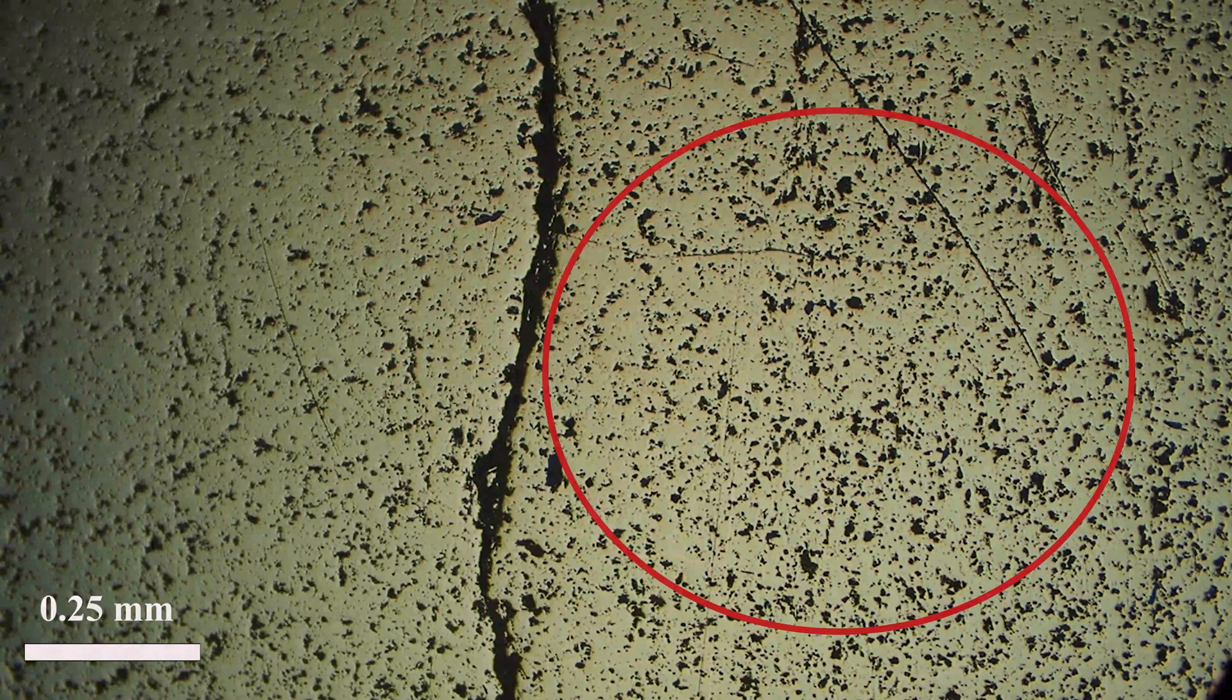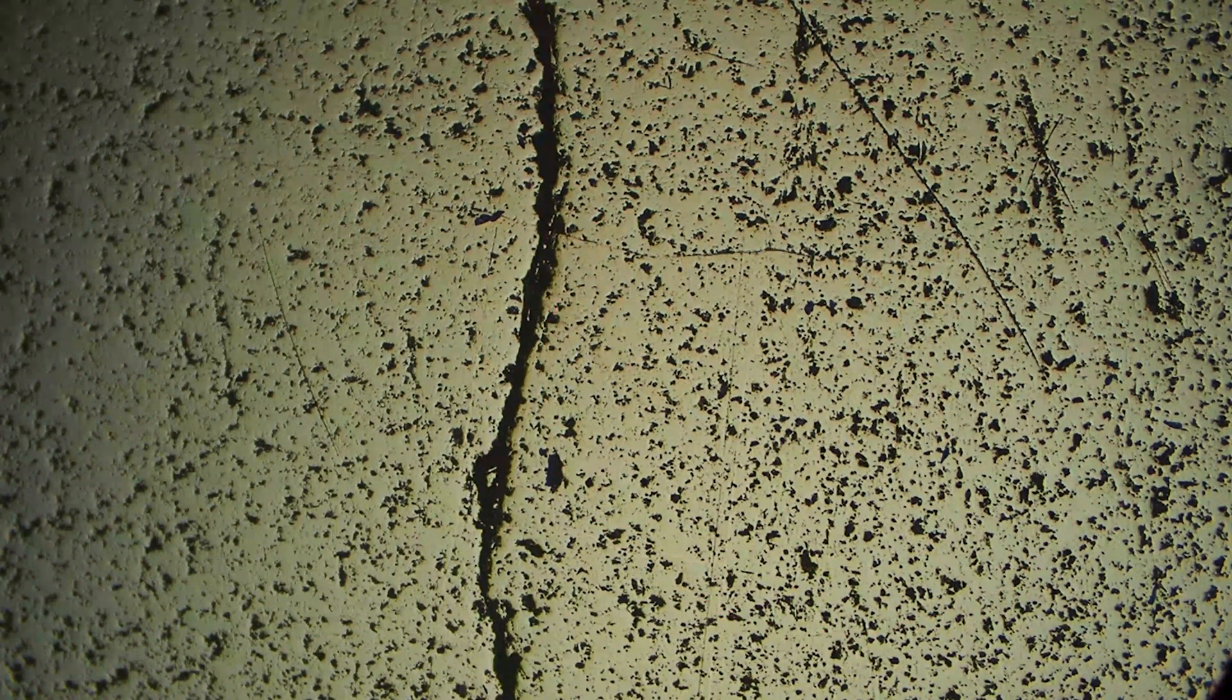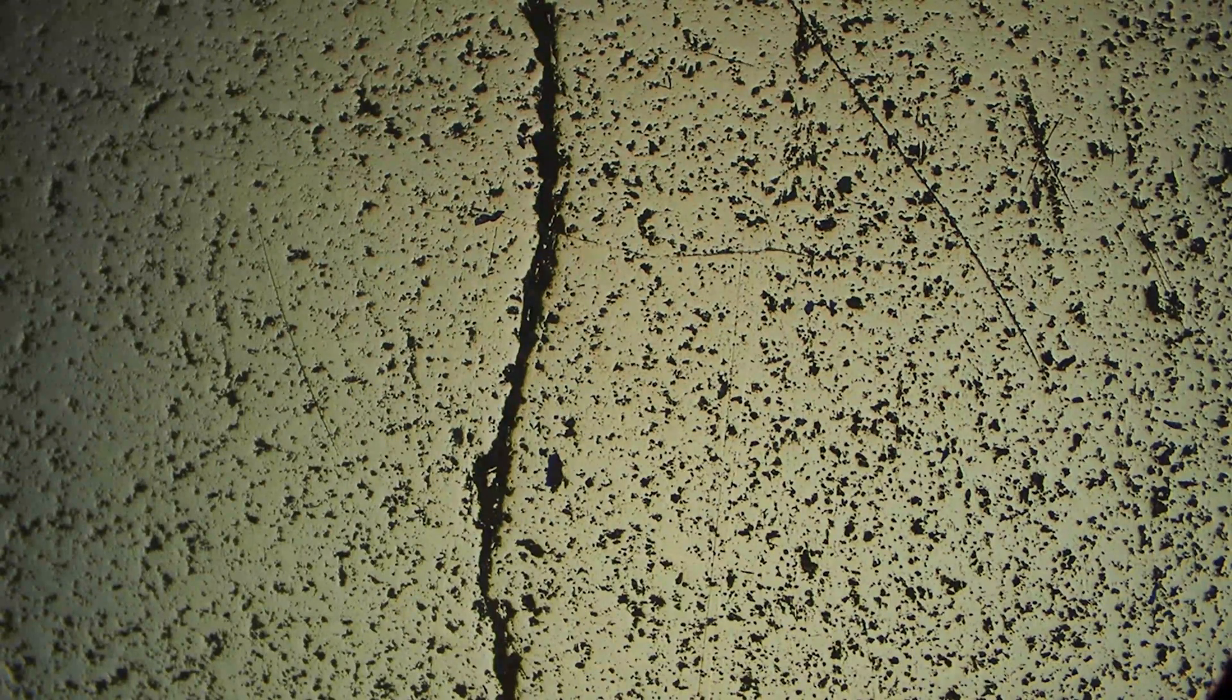Now we're going to talk about how to identify hematite in polished section. Here is some hematite in polished section. You can see there's quite a few pits. It's quite difficult to polish.